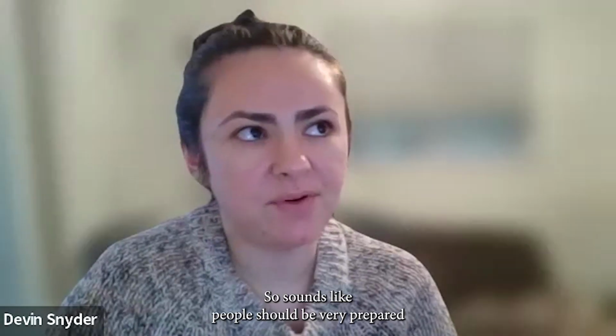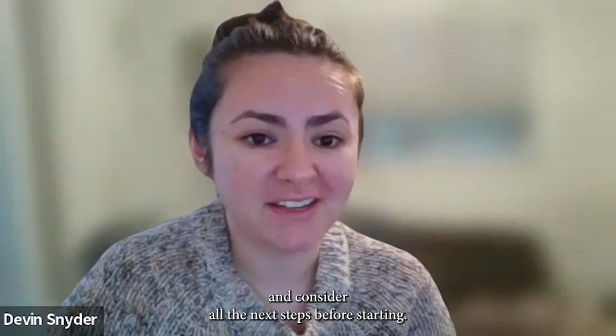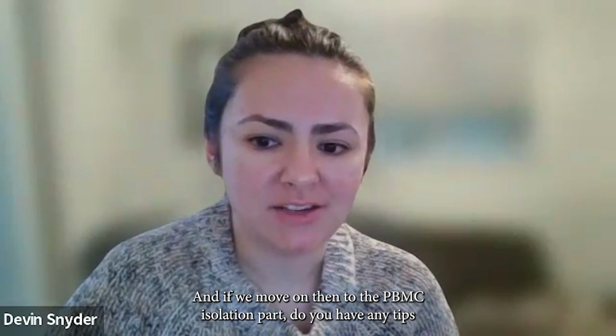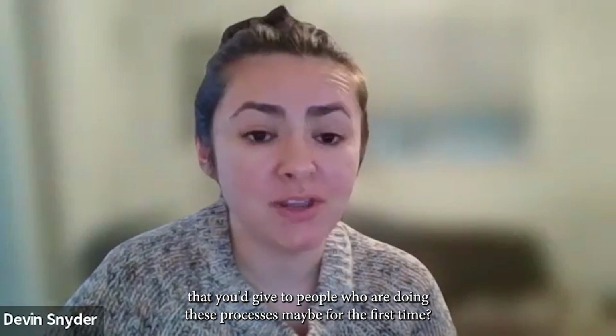Okay, so it sounds like people should be very prepared and consider all the next steps before starting. That's good to know. If we move on then to the PBMC isolation part, do you have any tips that you'd give to people who are doing these processes maybe for the first time?